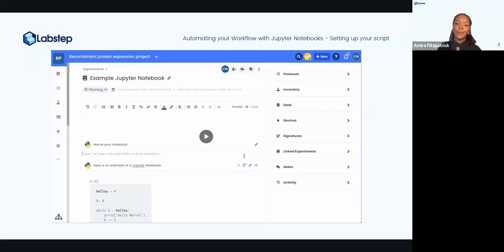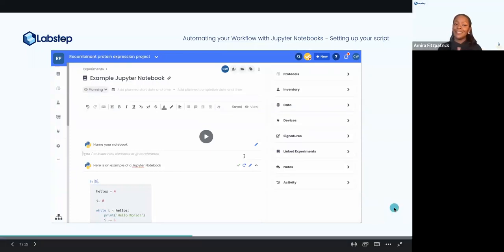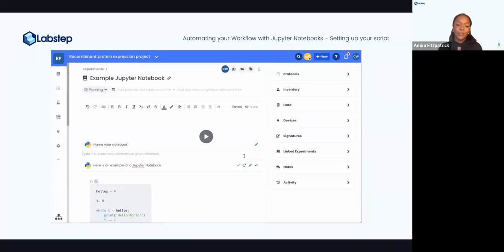Yeah, definitely. I know you guys are obviously really keen to start using it. It is a really cool feature. We will have a bit of a discussion on how you can access Jupyter Notebooks. And as Charlotte said, after the webinar, please reach out to us and we'll be happy to enable the feature for you. And once it's enabled, you can use that / command to start scripting away. So yeah, that's a really relevant question, especially when we encourage everyone to try along with us, but maybe don't explain it fully.